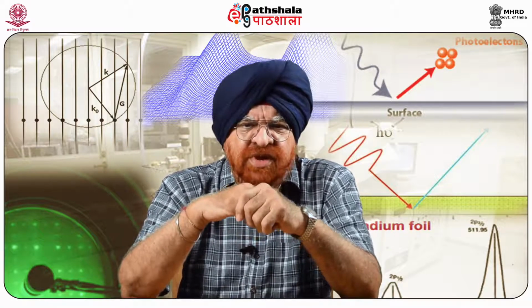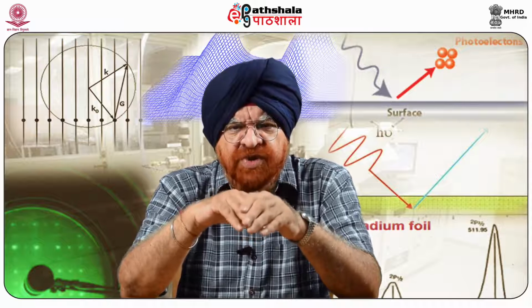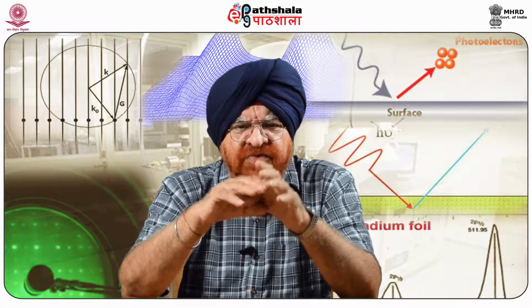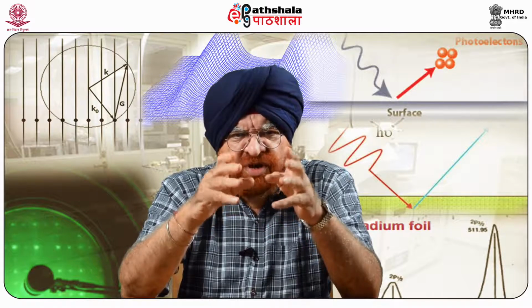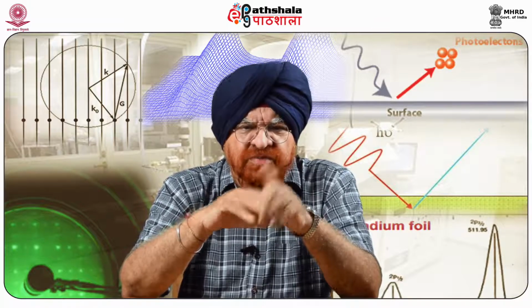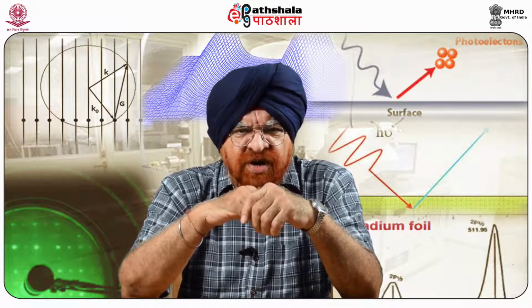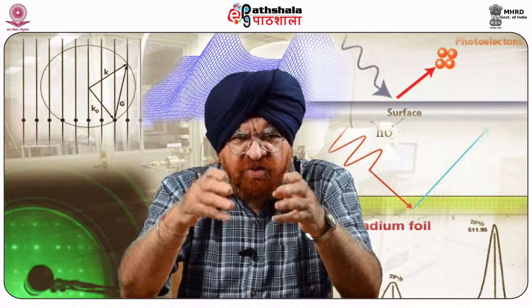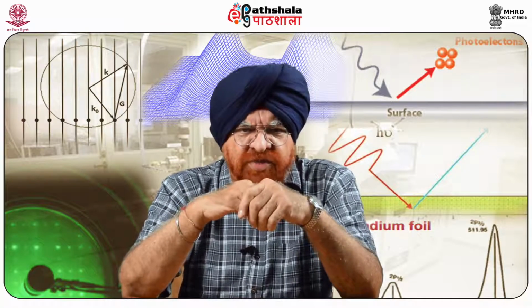The STM can only scan conductive surfaces or thin non-conductive films and small objects deposited on conductive substrates. As I said earlier, non-conductive surfaces cannot be very precisely studied with this, and that remains a limitation. It does not work with non-conductive materials such as glass, rock, etc., or anything that is going to be covering these. You will find it difficult to carry out imaging with the help of this.